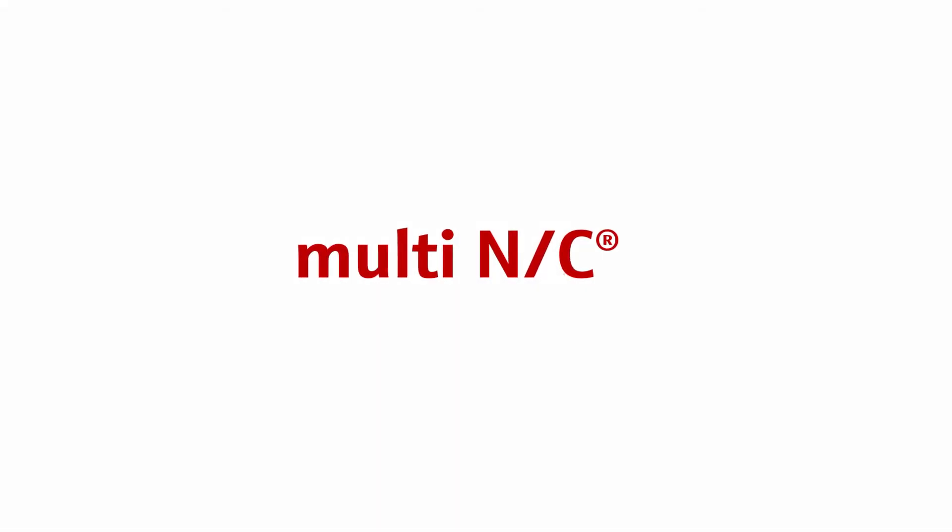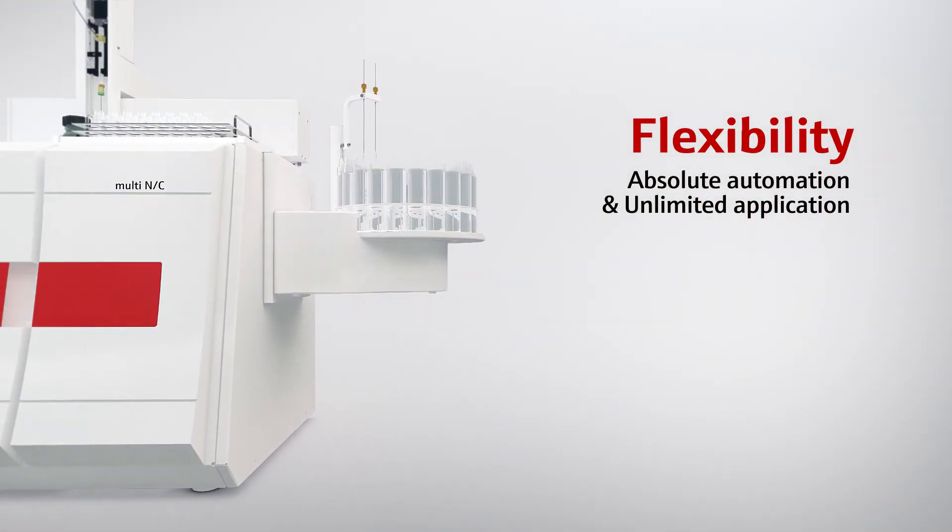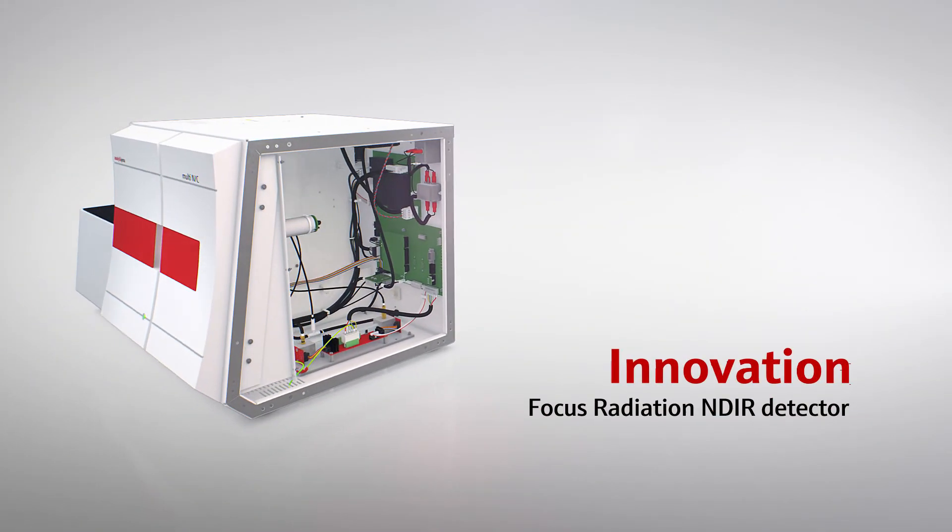The Multi-NC offers flexible configurations and the optimum solution for any TOC application. Your benefit: fast and precise results, while running costs are extremely low.